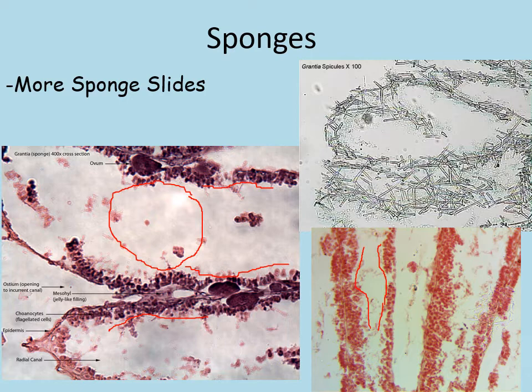And the spicules can be made of different materials, like there's glass spicules. There's also chalk spicules made of calcium carbonate. That's what we have here in this example. So this is a chalk sponge. There are the soft sponges that are made of spongin, the kind of spongy protein. But this would be a chalk sponge. So if you look at it under, in this case, 100 times magnification, you can see these, they look like little tiny glass shards, little fragments of glass.